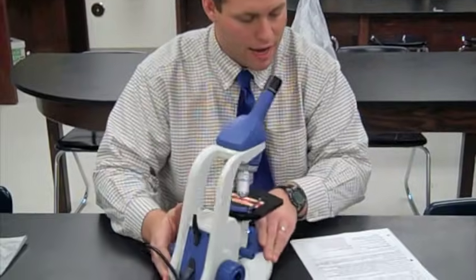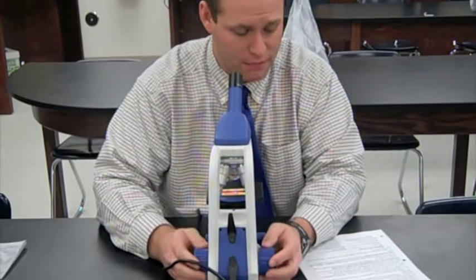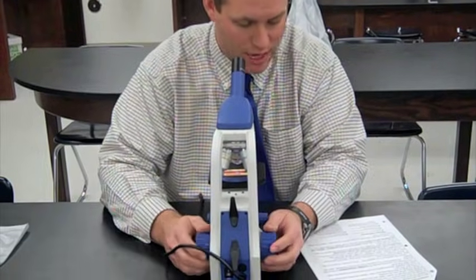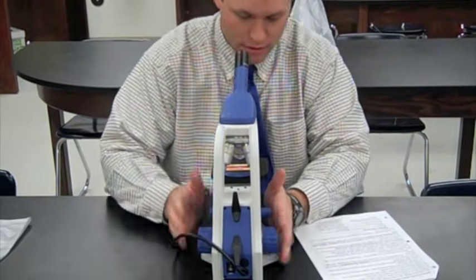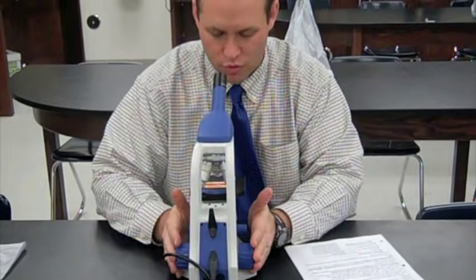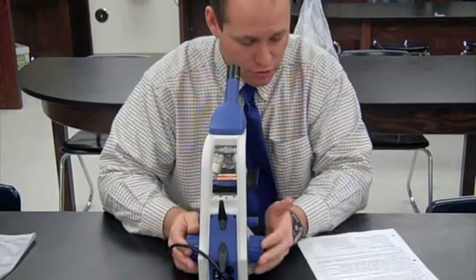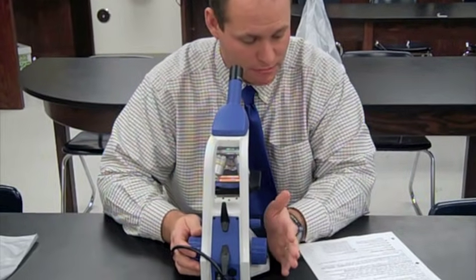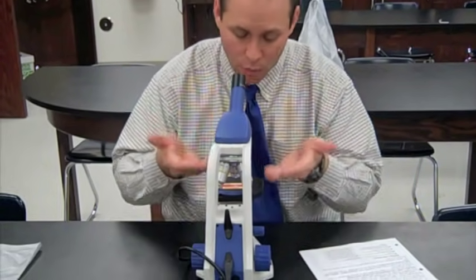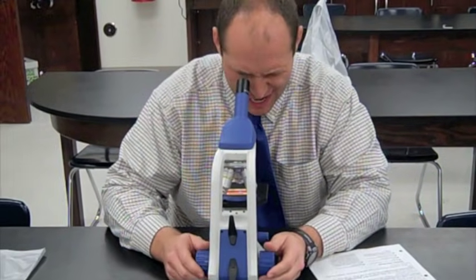Okay. Now, the next thing we are going to do is turn the coarse adjustment until the lens is almost touching the slide. It should be closing that distance you see right there, only using the coarse adjustment. Then we're going to look through the eyepiece using the coarse adjustment to focus the specimen. You always want to focus away from the slide first. Remember, slow and steady.